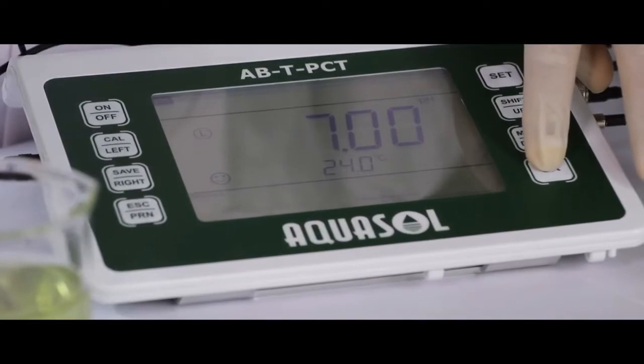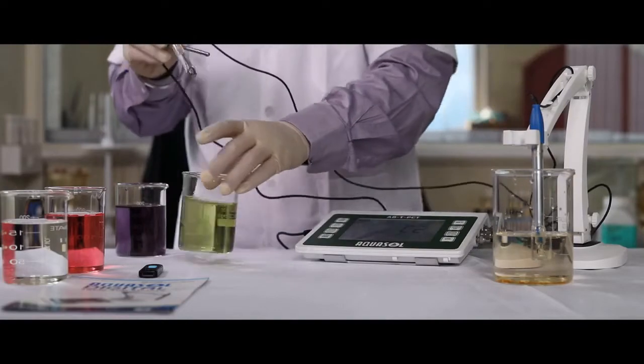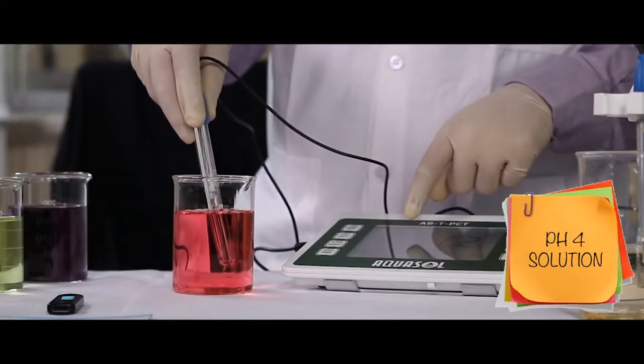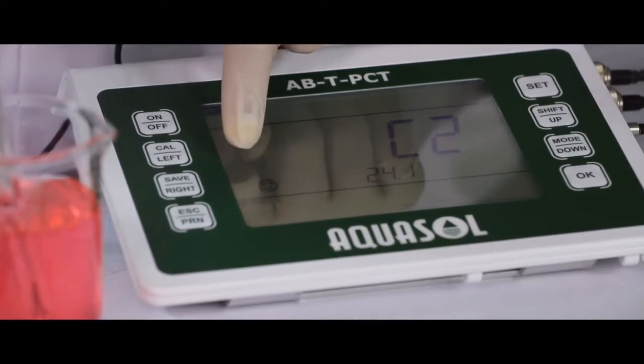The meter will ask for C2. Standard pH 4 solution is used for C2. Clean the electrode and dip it in the pH 4 buffer solution. Once the meter displays the smiley, press OK to calibrate.